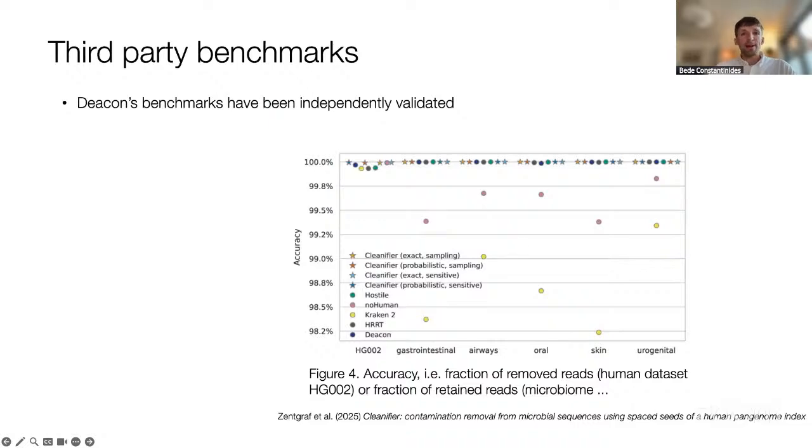There was a lovely paper recently describing a conceptually similar approach to Deacon, but with a very different implementation, which I had the pleasure of reviewing. The authors benchmarked Deacon and showed that their approach and Deacon are both considerably more accurate than Kraken-based methods, which was reassuring and validates the analysis I was just referring to. I should say that Deacon has improved rather a lot since this benchmark and is now considerably faster, for example, than their figures suggest. But in my opinion, in terms of accuracy, both of these tools are in similar territory, and I think are good choices for panhuman depletion.